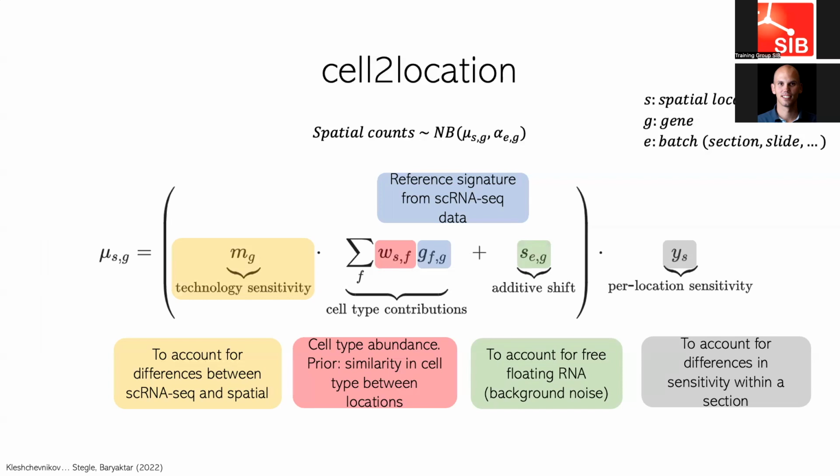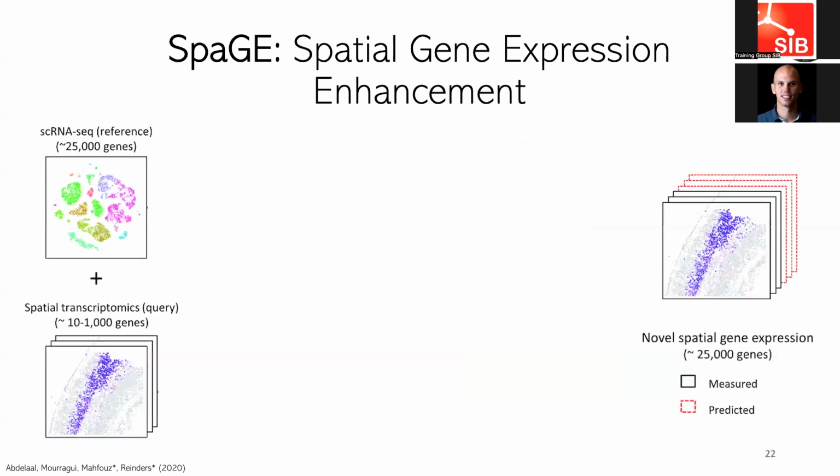Okay, a slightly more complex model, but at the end, we're trying to learn these weights that tell us, in this particular spot, what is the weight or contribution of every cell type from my single cell data to the observed count over there.